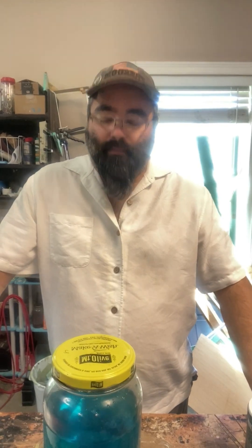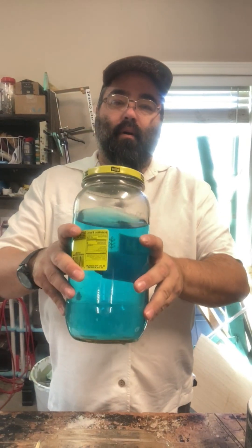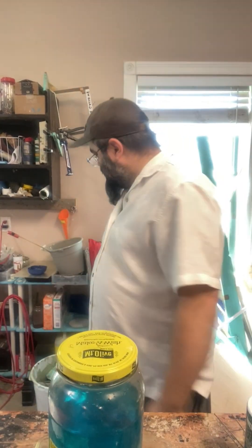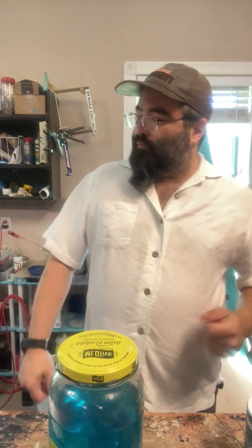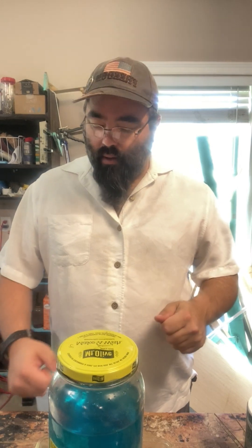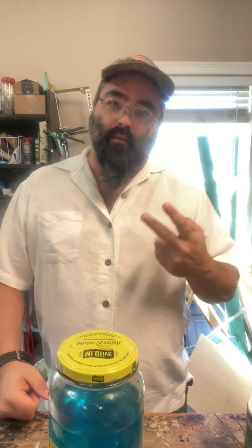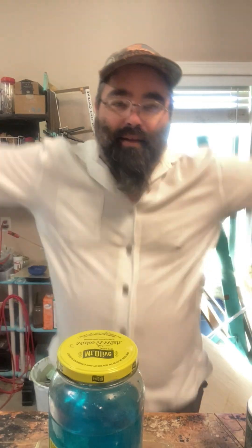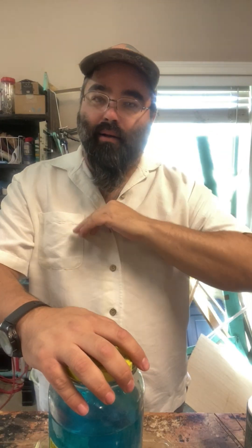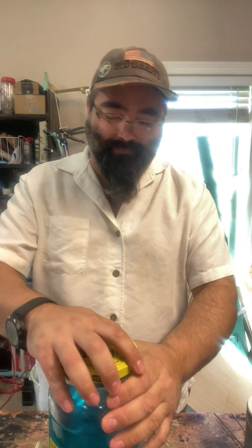Hey everybody, welcome back to the channel. We got another big pickle jar of copper sulfate to get the copper out of. This is the third video — or two and a half, since I didn't press record on one of them. I did a whole video with no recording, so we're just going to jump right into this.